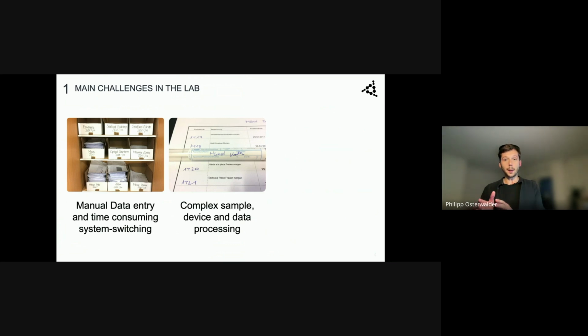The second big challenge is complex sample management, sample processes, device management, and also data handling. Overall, it is the administrative, unproductive work where a lot of lab technicians burn time, and for quality management, or from the overall company view, burn money.